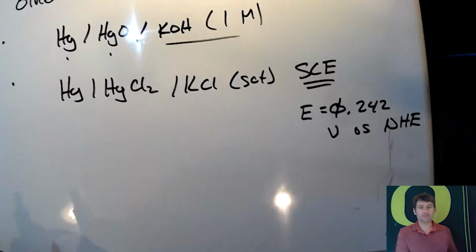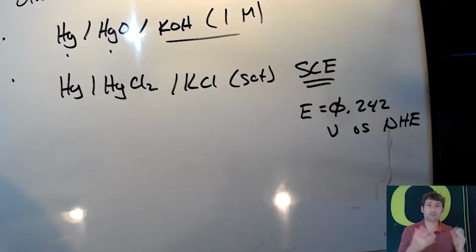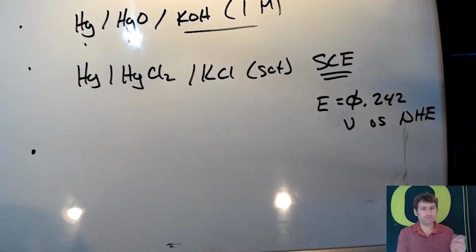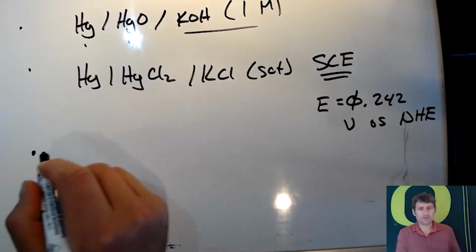And then, of course, there is the standard hydrogen electrode. And these days you can actually buy reversible hydrogen electrodes, a nice little package that actually bubbles hydrogen over a platinized catalyst that senses the hydrogen potential. But we typically don't use these in the lab except for calibration, because they're sort of expensive and difficult to use.